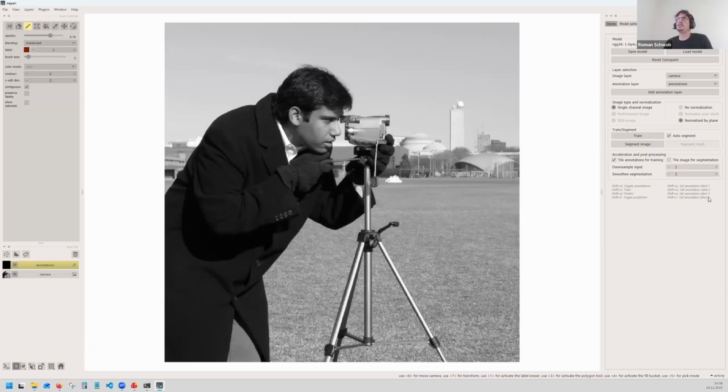But if, for example, you have a very detailed image of cells where you can detect different parts of the cell, like the nucleus and maybe mitochondria and things like these, so maybe you have 10 different things that you want to segment, then obviously you should also use annotations for all those 10 things. I think we'll go on. Okay, thanks for the thumbs up. I'm happy this worked. And let's go on with this example.